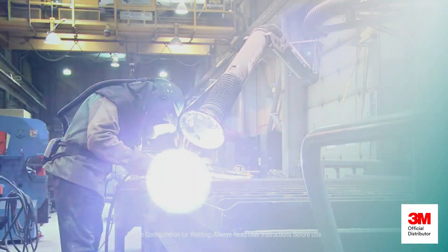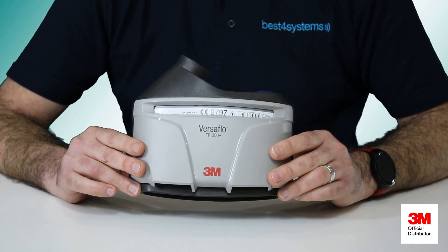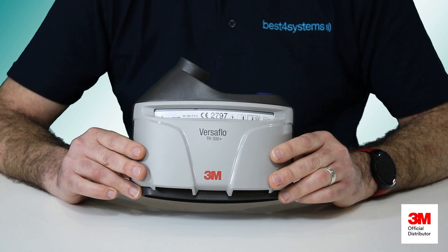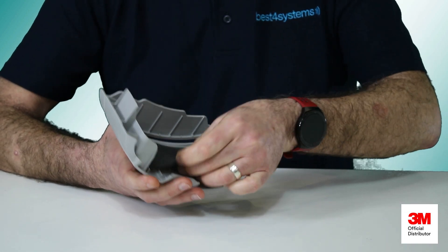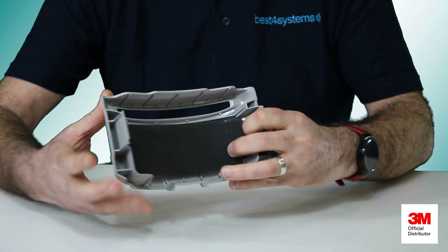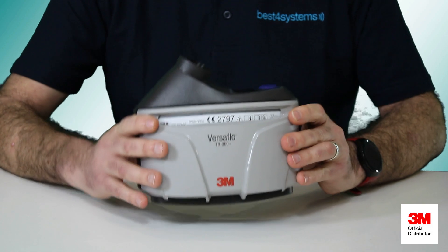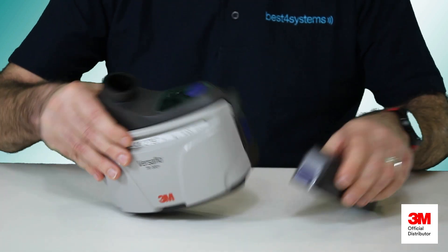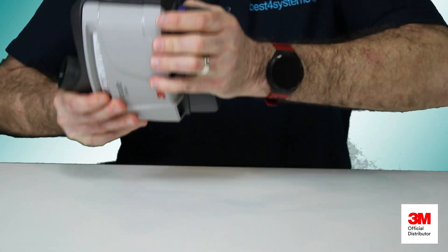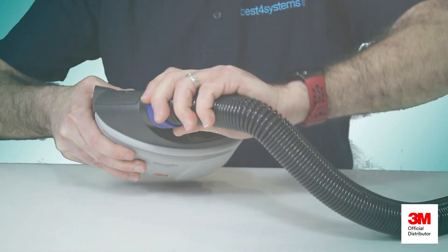The 3M Versaflow TR315 setup is very simple. Here is the powered air unit. We simply insert the pre-filter and spark arrestor, then the filter and filter cover. The battery clicks into place just like so, and then you connect the air hose and your choice of head top.